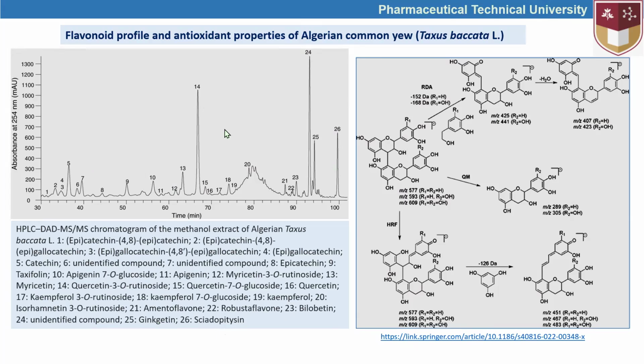And by using the mass spectral data, for example, when this peak was sent to mass spectral analysis, this kind of structure could be suggested based on the split of this charged molecule into smaller fragments after ionization. Here we can see that these two molecular ions differ from each other by this group.